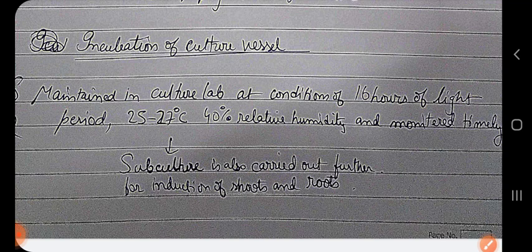Then further we have to check them periodically, repeatedly after 2 to 3 days. If there is contamination, we have to set those aside. We have to remove them from the other cultures, otherwise that contamination can spread to the other vessels as well. For subculture we have to do the same procedure again, but this time we will not do the surface sterilization of the explant. The other things we have to do repeatedly when we are transferring the plant tissue to a new vessel containing certain changes in the concentration of the hormones, maybe for the induction of shoots or roots.